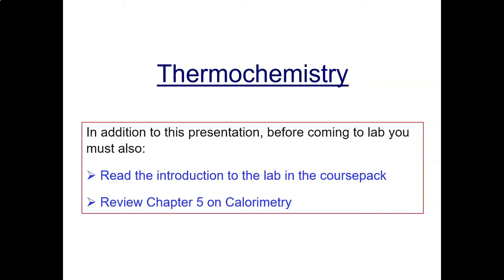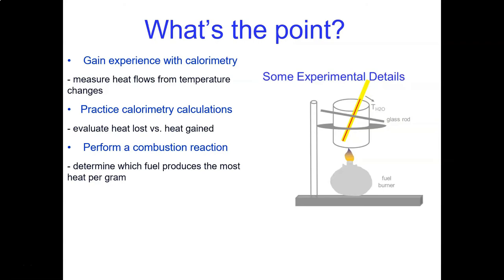Hello, this week we will do some thermochemistry experiments. In addition to this presentation, before coming to the lab, you must also read the introduction to the lab in the course pack and review chapter 5 on calorimetry. What's the point of this lab?